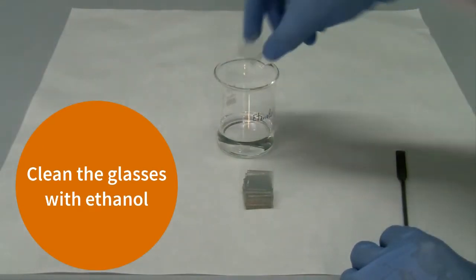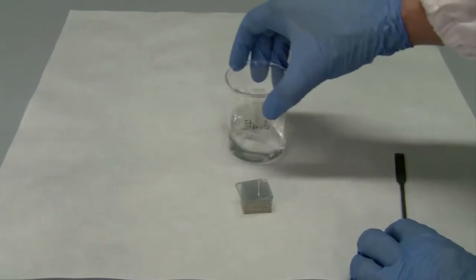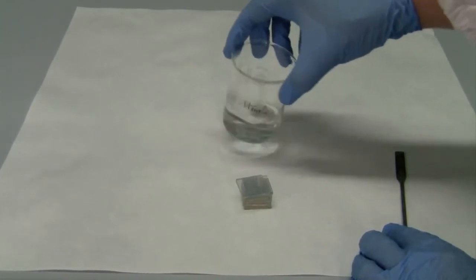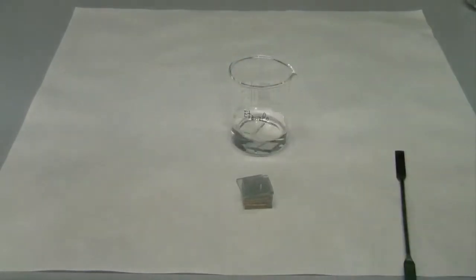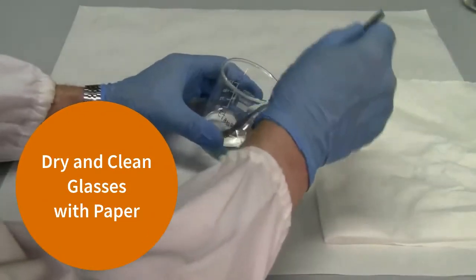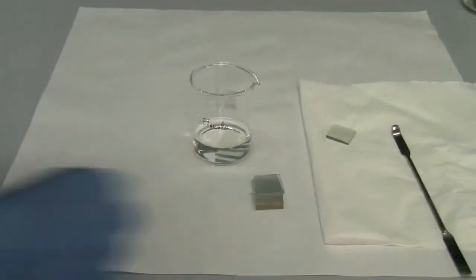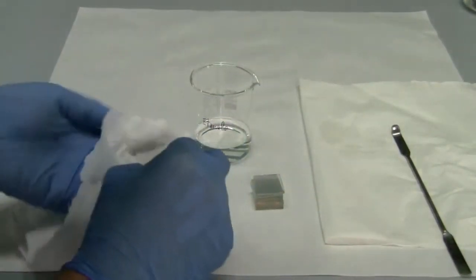Before starting, all glasses should be inserted into ethanol, to clean them from every dirty material like oils used for production, or simply the fingerprints if you touch them with your fingers. Normally, since now we'll have to keep these glasses just only from the edges. After a few seconds of washing, we can extract our glasses with the help of a spatula, deposit them onto the paper to drain the ethanol, and after we can keep them within our fingers with a piece of paper to clean them and to prepare them for the further deposition of titania.